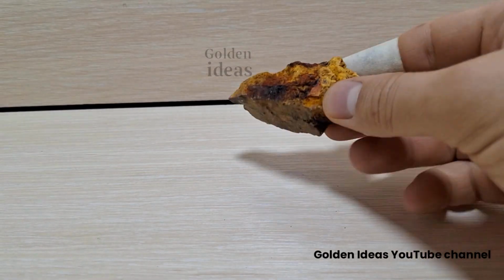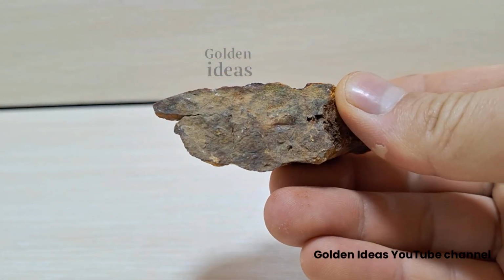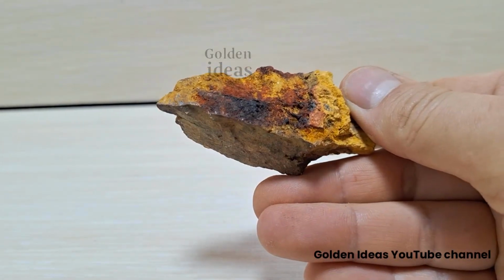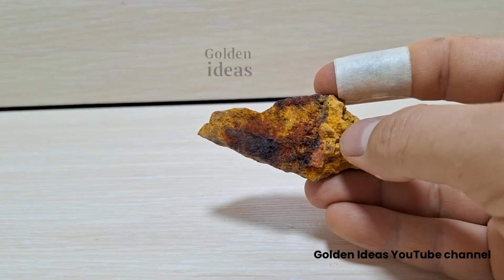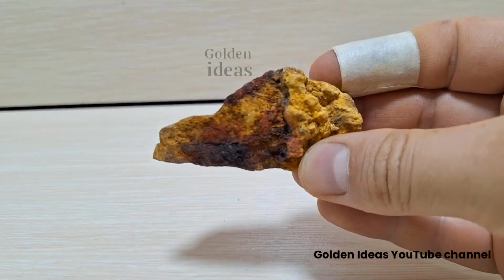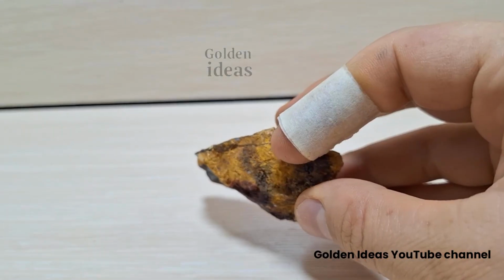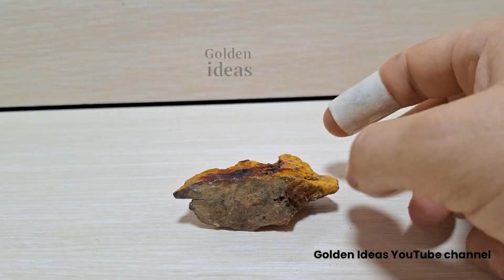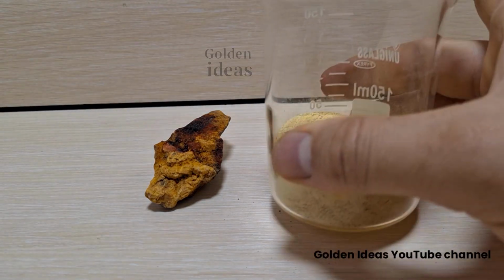Hello friends. It is a hematite stone and contains a very small amount of gold. Hematite is an oxide type of iron ore, and sometimes it can contain heavy metals. I deliberately chose this stone because it has very little gold. My goal is to introduce you to a method that is suitable even for low-grade mines. But if you have rich mines, I definitely recommend this method. Friends, only gold, platinum, copper and silver can be extracted in this method.